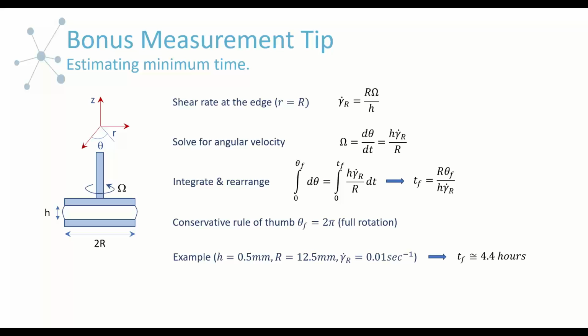You just have to experiment with your system and see what it takes to get quality data. Again, there's always a little experimental phase when you're doing rheological measurements. But you really want to be cautious when you're doing these low shear rate measurements and make sure you're choosing your parameters properly so you can get the best data.